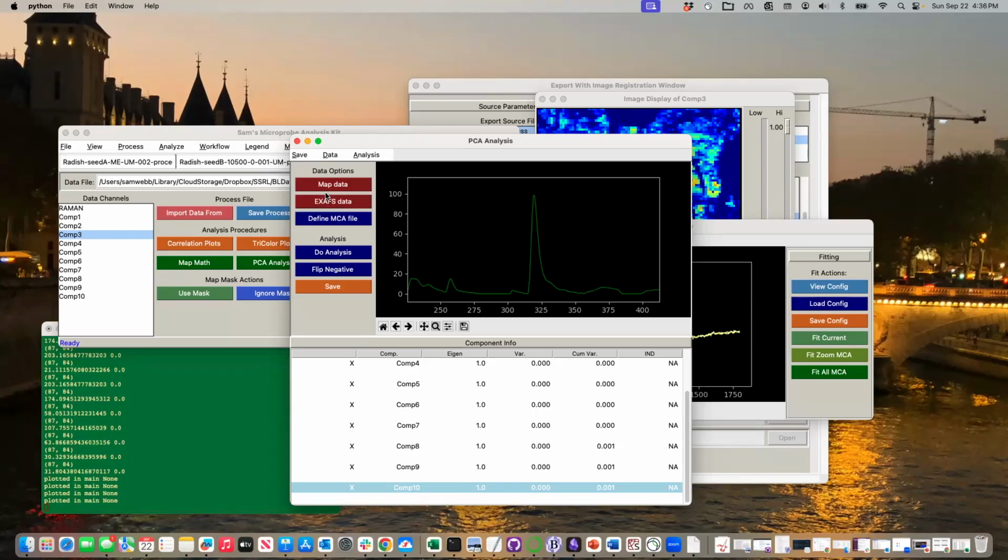If you want to save all these values, you can say save components to file, and it'll save all of these spectra to file. So you can go back and look at them later and remember what component 10 looks like, and 8 and so on. I have half a mind one day to combine this into a Raman library and actually try to do some peak finding and peak matching, at least for the mineral people. Haven't quite got there yet.